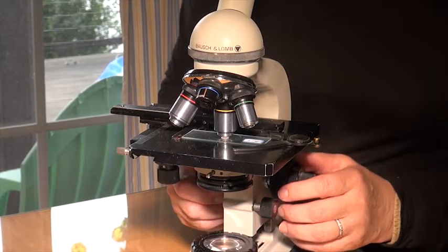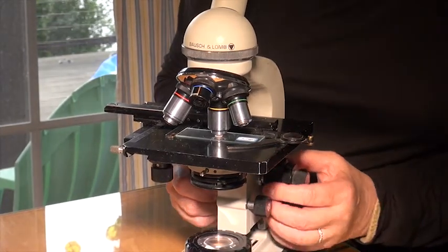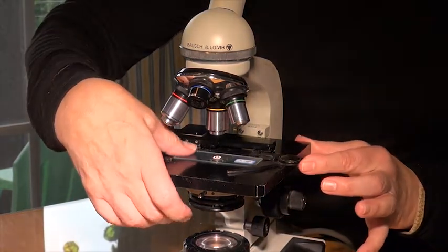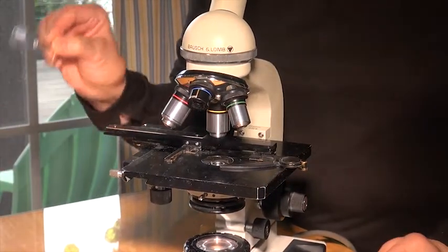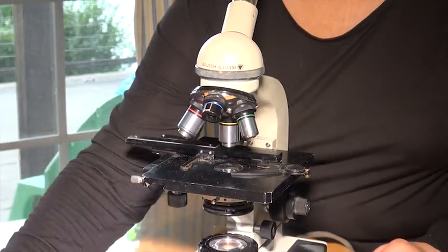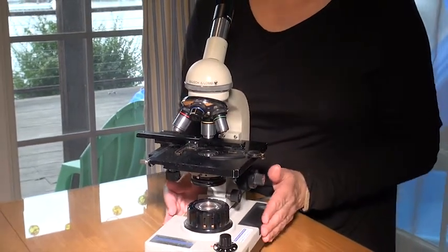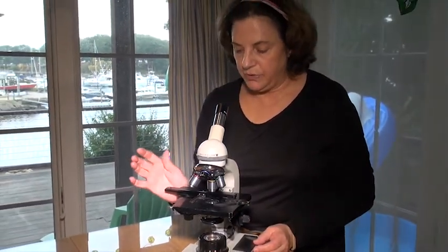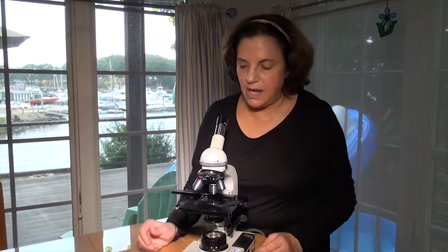We're ready to make our own slide, but we have to remove the current slide. You don't just yank it off. Lower the stage to give yourself some working space, then use the slide clip and your finger to take your slide off. Return it to the designated slide tray. Be mindful to reach around the microscope — you don't want to hit the slide adjustment carriage and mess up everything on the microscope.